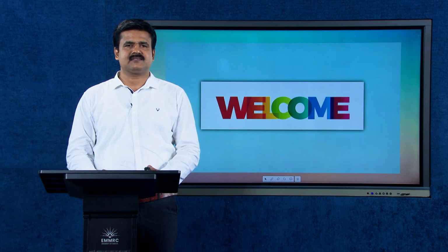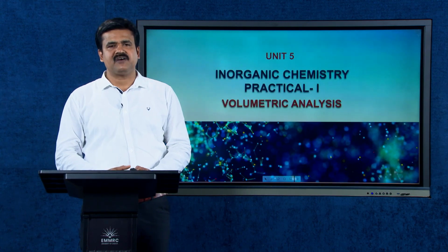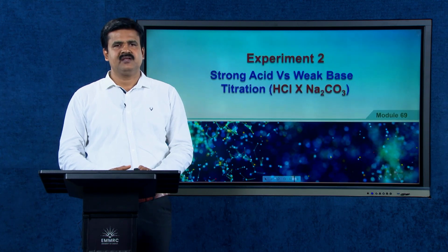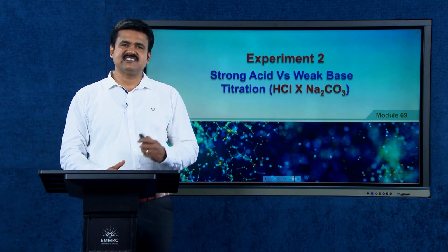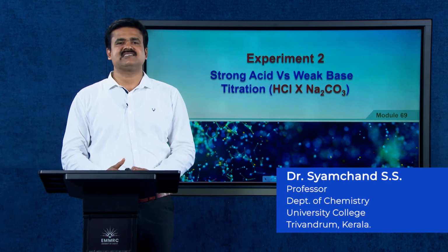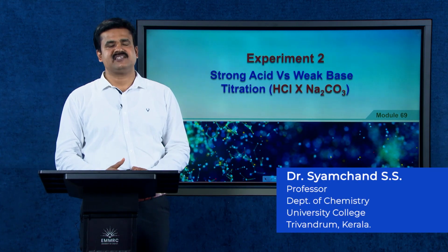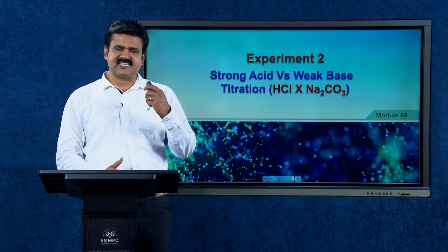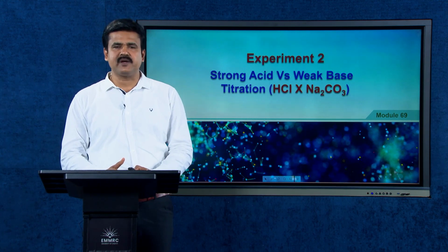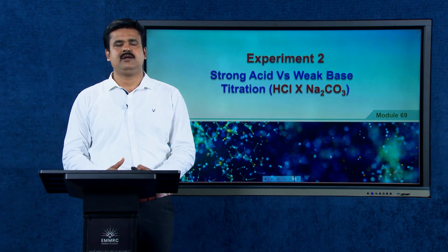Welcome dear learners. We are continuing Unit 5 Inorganic Chemistry Practicals 1 Volumetric Analysis. In the present module, we are discussing experiment number 2, that is strong acid versus weak base titration. As a selective example, we are taking hydrochloric acid against sodium carbonate.